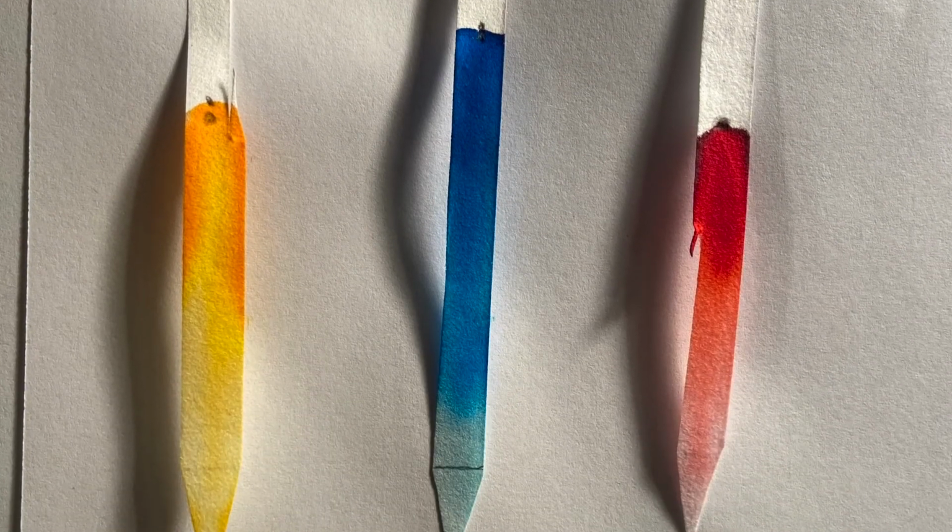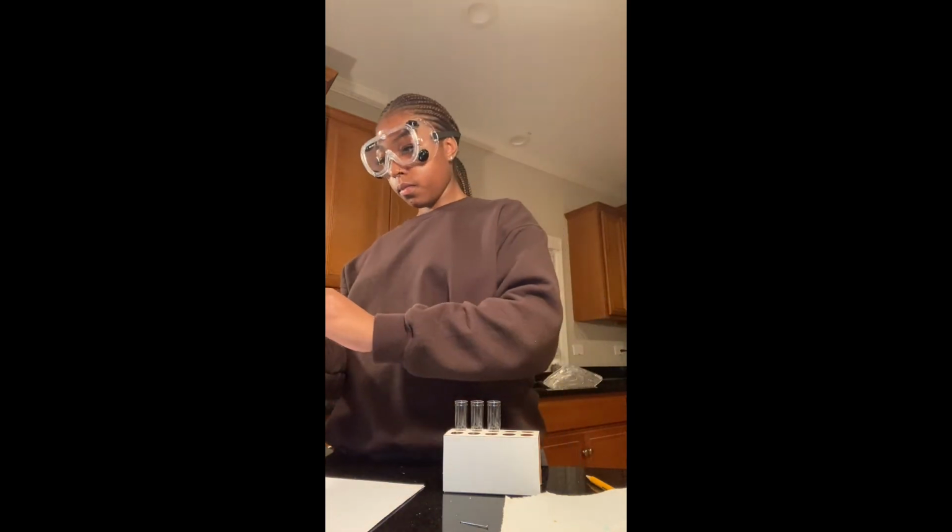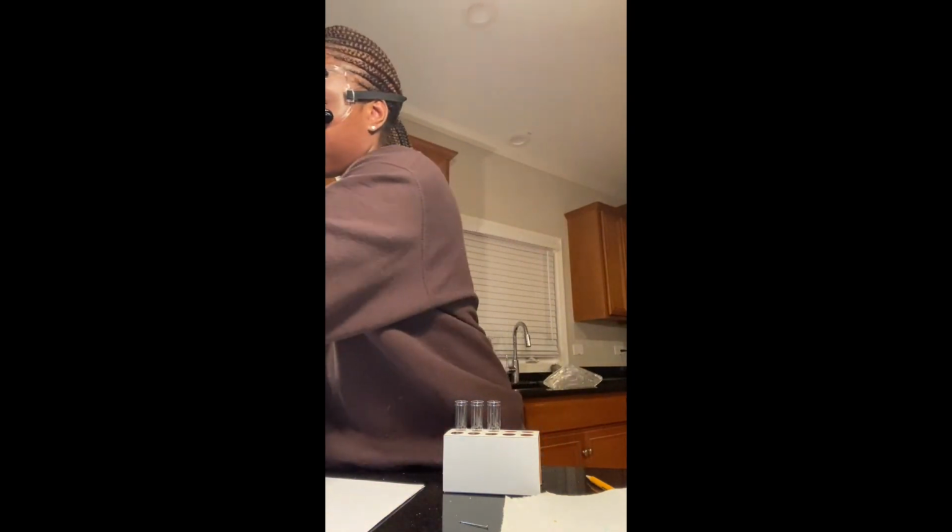Here's a picture of my results after dipping the food dyes into the solvent. Next, we're going to repeat the same steps, but instead using the Kool-Aid samples.